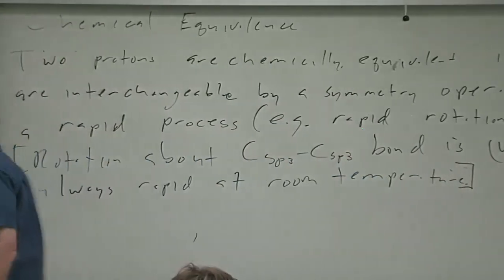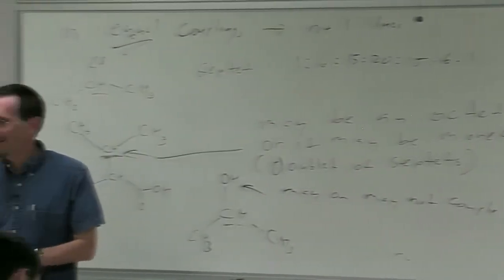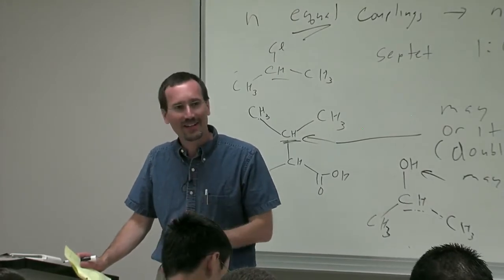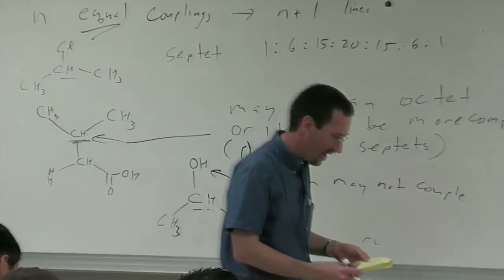That's a hint. If you see two hydrogens splitting each other and they're both on sp3 carbons attached to each other, chances are you need to think deeper. And it's not, oh, there's some slow process.